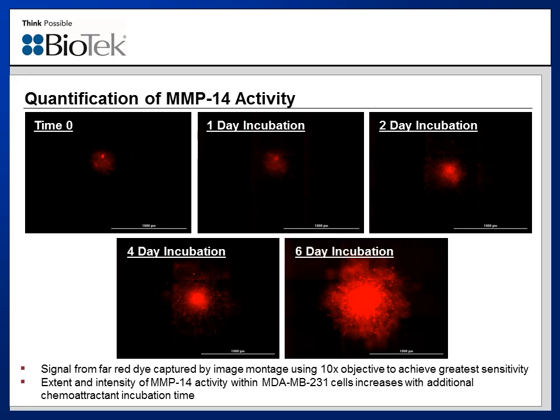The first step in the project was to test the ability of the assay components to work properly within the context of the 3D tumor invasion model, as I just explained in the previous slide. The MMP14 substrate was selected for inclusion as this particular MMP has been shown in the literature to play a critical role in conferring cells with the ability to penetrate the extracellular matrix and is directly linked to tumorigenesis and metastasis.